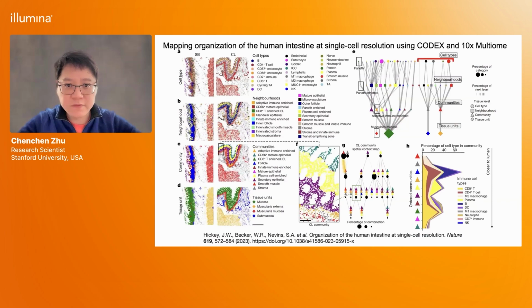And in phase 1 of the HuBMAP project, we have used the CODEX technology. It is a spatial proteomics method that can target about 50 antibodies using different cell type markers to understand what the cell types are and how they are structured together. And we've worked out a very nice spatial map for both the small intestine and large intestine.